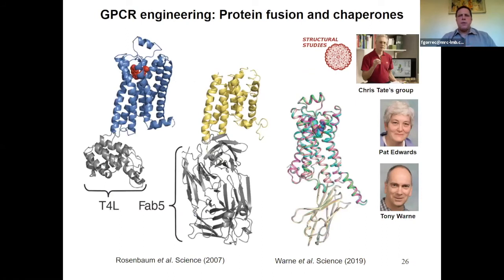So far, what we've seen is about reducing the size of the sequence of the sample and simplifying it, rigidifying it. Sorry, but that's not always the direction that is taken. Sometimes you produce a more complex and larger sample to be able to crystallize it, and that's often the case with GPCR studies.